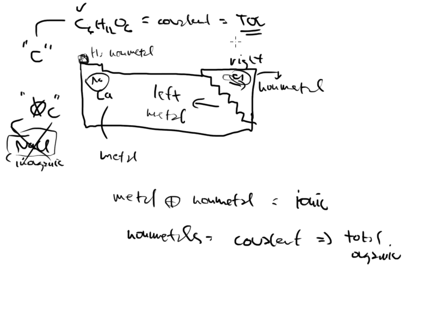C6H12O6 is actually glucose. That is just your blood sugar, pretty much. I mean, that's all that is. So this could be detected in a water sample using a TOC instrument because, number one, it is carbon-based. Number two, it is not classified as an inorganic source. There's no metal and non-metal mix. It's all non-metals here, so that is a good sign that it falls in the TOC category.